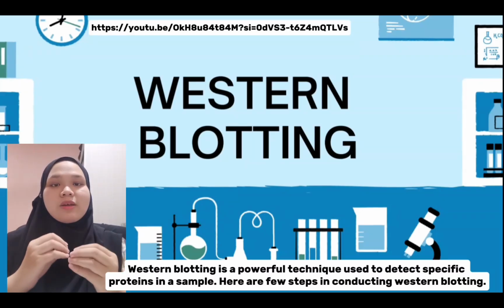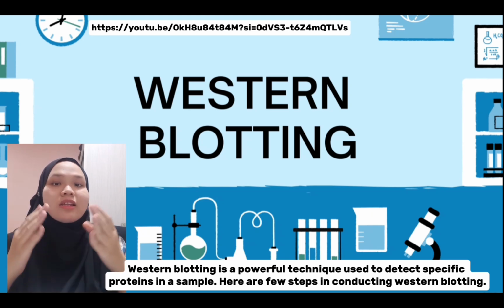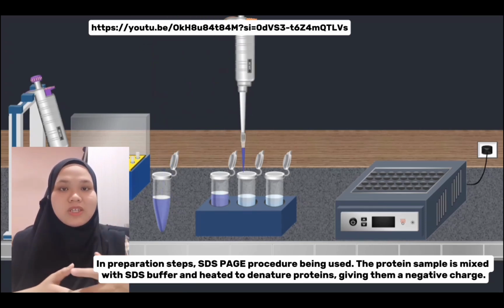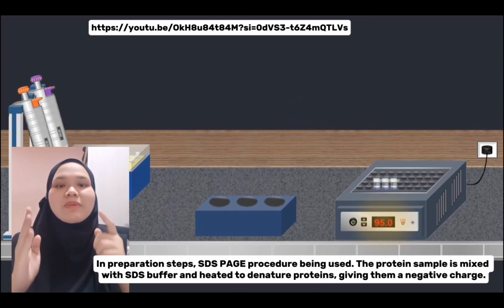Western blotting is a powerful technique used to detect specific proteins in a sample. Here are the few steps in conducting Western blotting. In the preparation step, the SDS-PAGE procedure is used. The protein sample is mixed with SDS buffer and heated to denature proteins, giving them a negative charge.